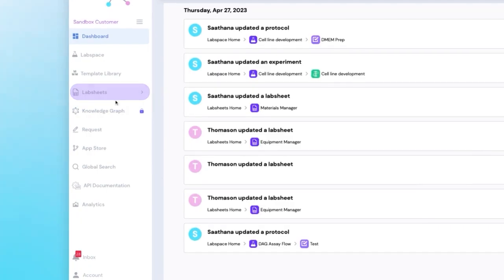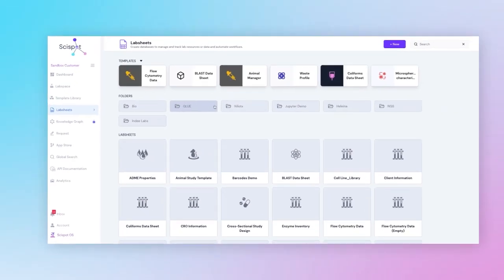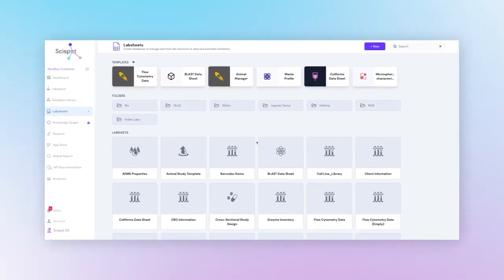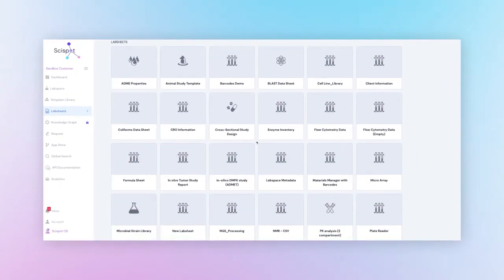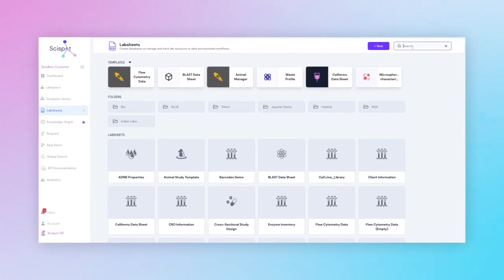Next, we'll move on to Lab Sheets. Here, you can create databases for your inventories and different R&D requirements.